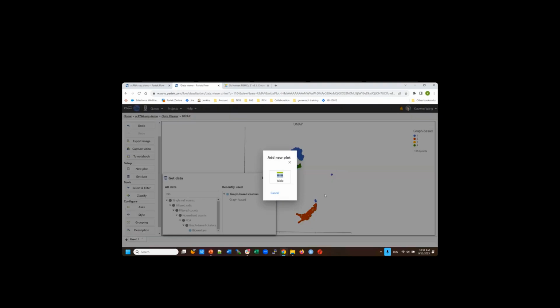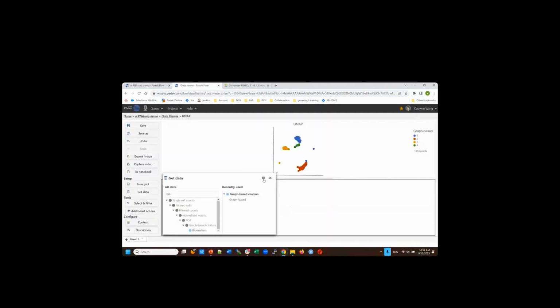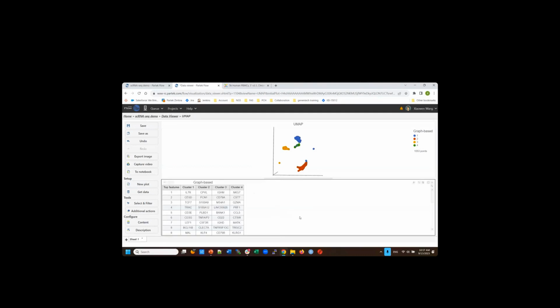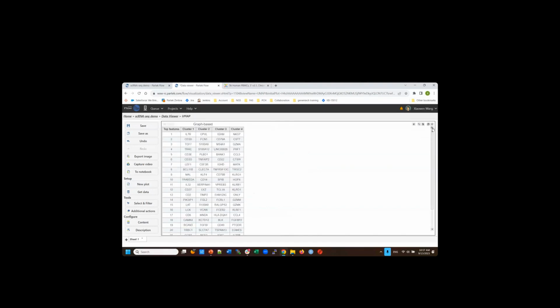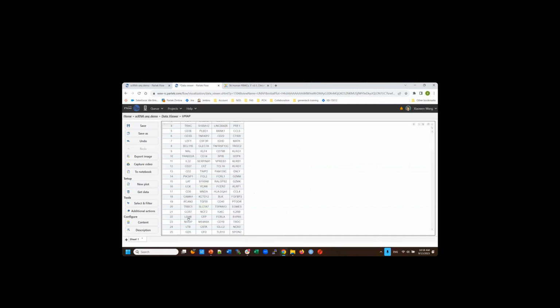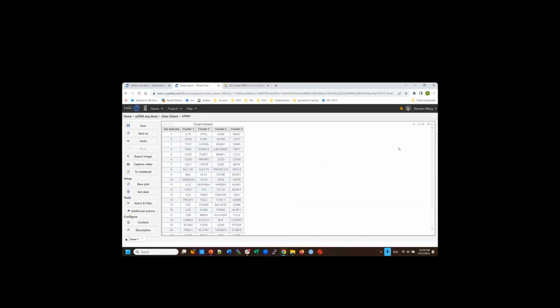For this biomarker, you can only make a table. That's the only choice; you cannot make anything else. Also, there are videos. Whenever you use a dialogue over here, you can click on this how-to videos to learn the software. Now I have the biomarker table over here, and I can see 25. If you download, there's a download button right here that will give you more genes and the p-value and the fold change, etc. You can use that to make your own cutoff. But by default, it will only give you the top 25 genes as the biomarker.